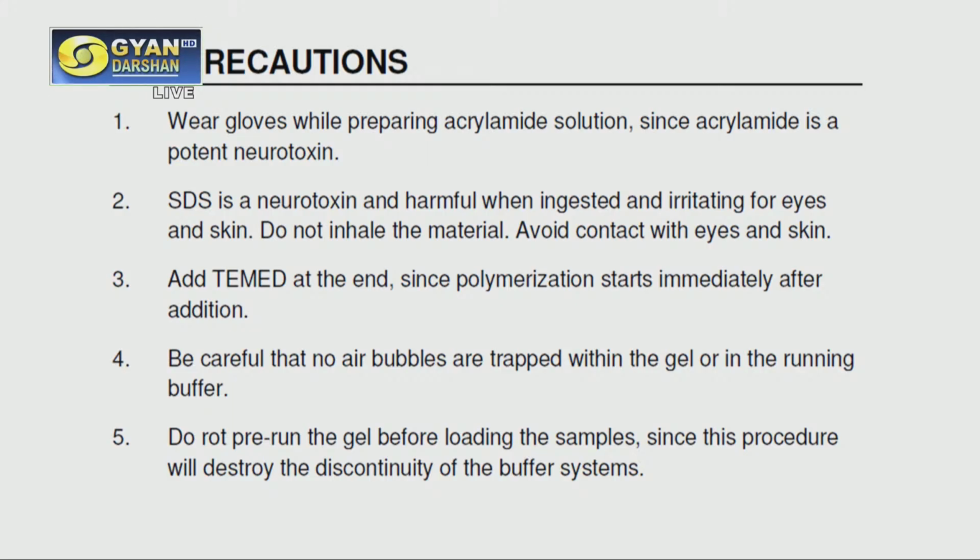TEMED should be added at the end, because polymerization will start immediately. And when you are pouring the gel, this is another very important point: make sure that no air bubbles are trapped in the gel. Otherwise, they will interfere with the running process. Do not pre-run the gel before loading the sample, because this procedure will destroy the discontinuity of your buffer systems.